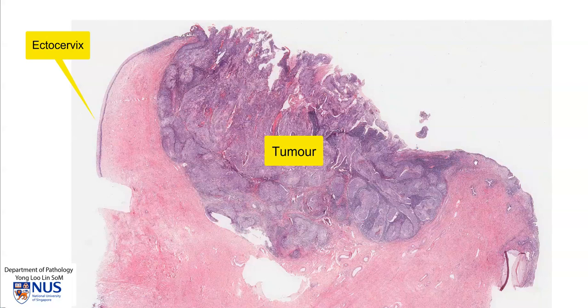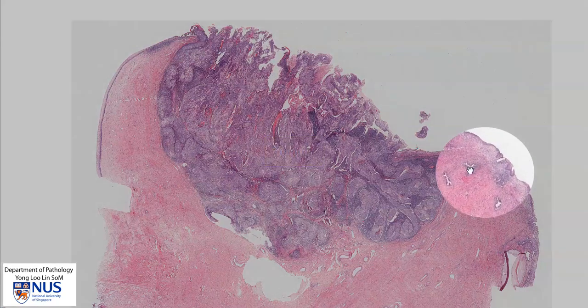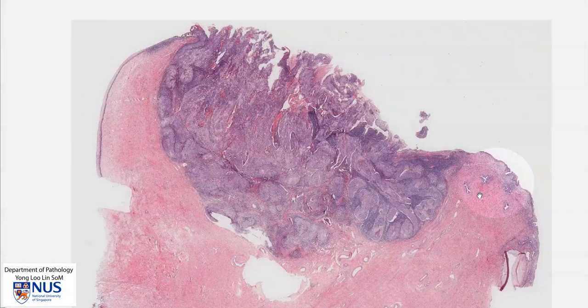Moving on to the right side, this is coming to the endocervical end, going upwards into the endometrial cavity. And here we have some endocervical glands that are dipping into the stroma, which is a normal finding.